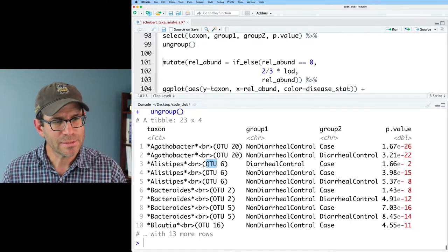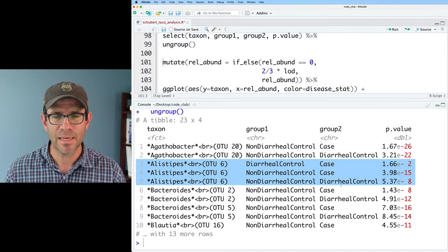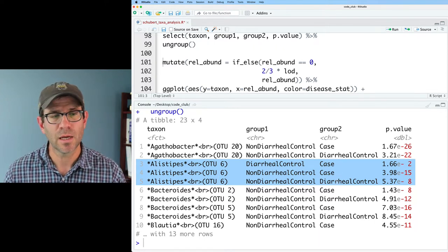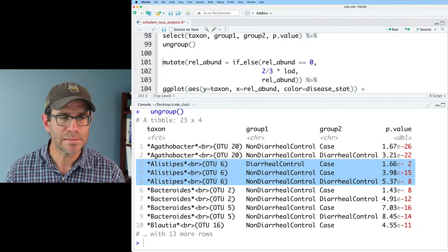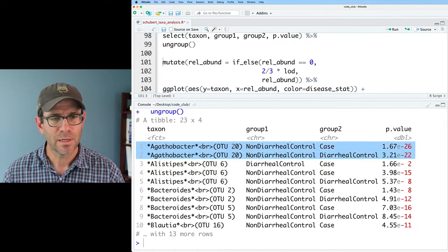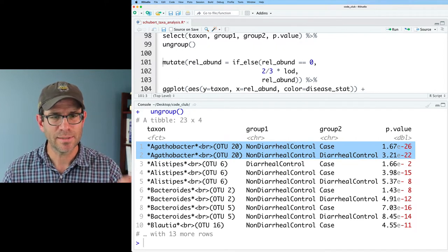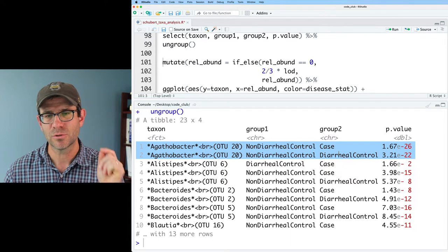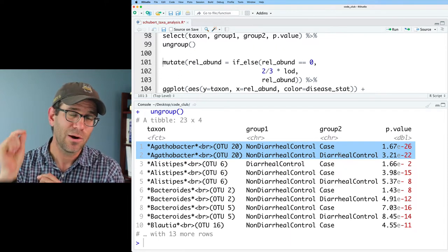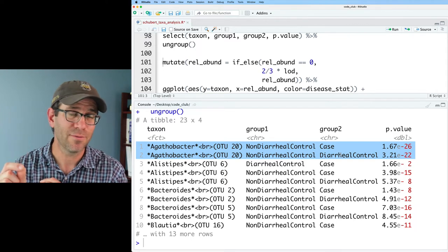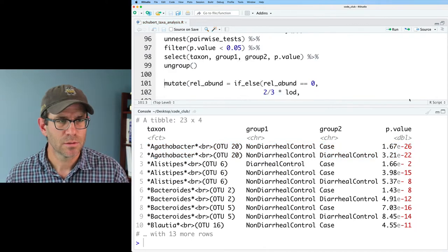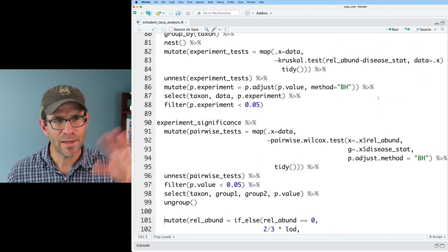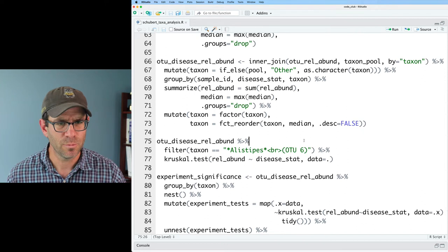Again, what we can see is like for Alistipes that OTU6 that I picked originally as our test case, all three of those disease status groups have a significant different relative abundance. Whereas like Agathobacter OTU20 is distinct between non diarrheal control and case, non diarrheal control, and diarrheal control. So basically the two diarrheal samples are not significantly different from each other, but they are significantly different from the healthy subjects. So the last thing I'd like to do is let's go ahead and remove this pooling by abundance.